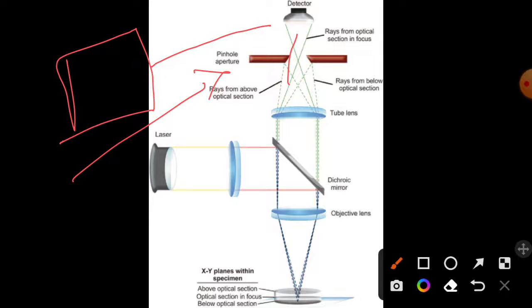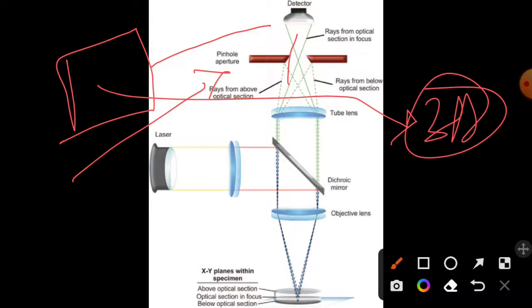The computer will use each and every digitalized information to form a composite image which will be brighter and more accurate. With the help of this you can construct a 3D image or get a brighter image, and it also allows you to view the image from various perspectives.